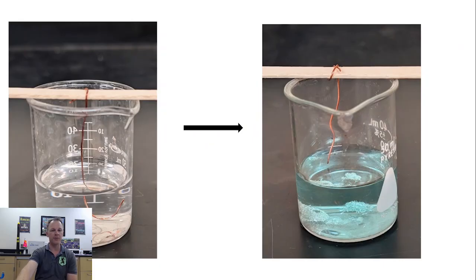All right, so you did the experiment and hopefully you noticed some changes. What kind of changes did you notice? Most people noticed that the copper turned black first, and then little white crystals started growing on it.